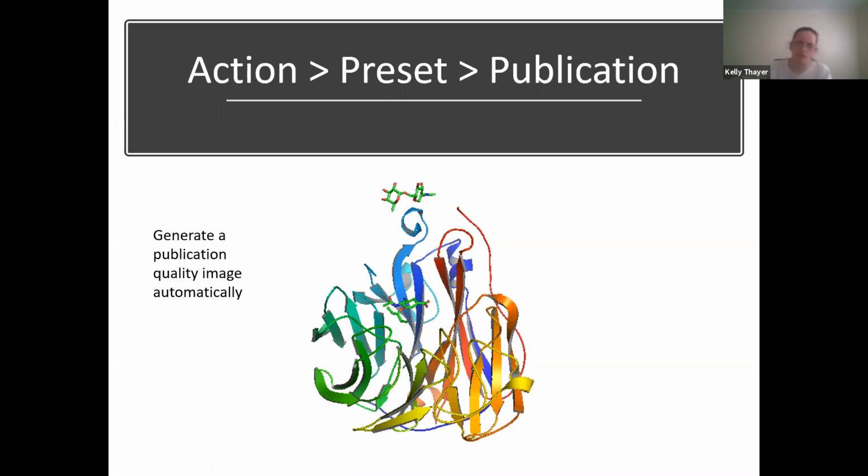If you have residues of interest in, say, an active site of interest, you may want to go back into this and go ahead and add those, and we'll be showing you how to do it. But this could be a great way to get started.